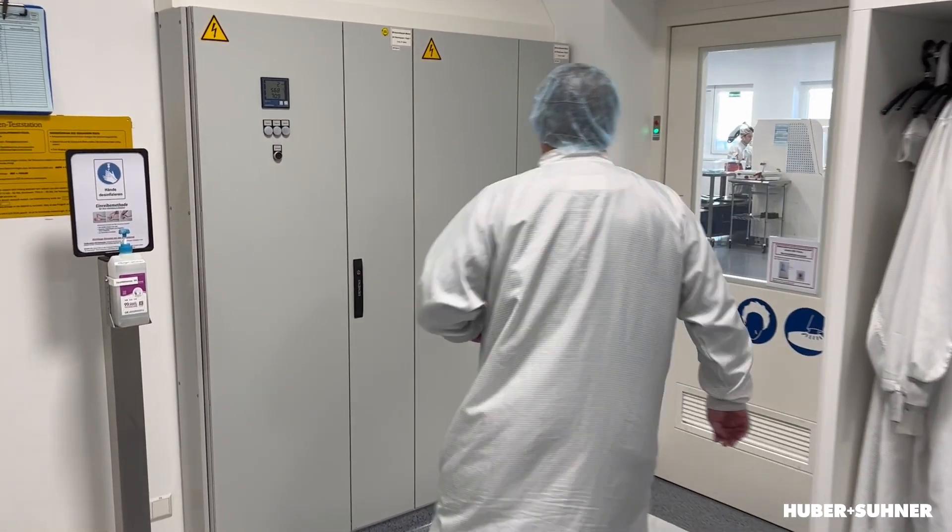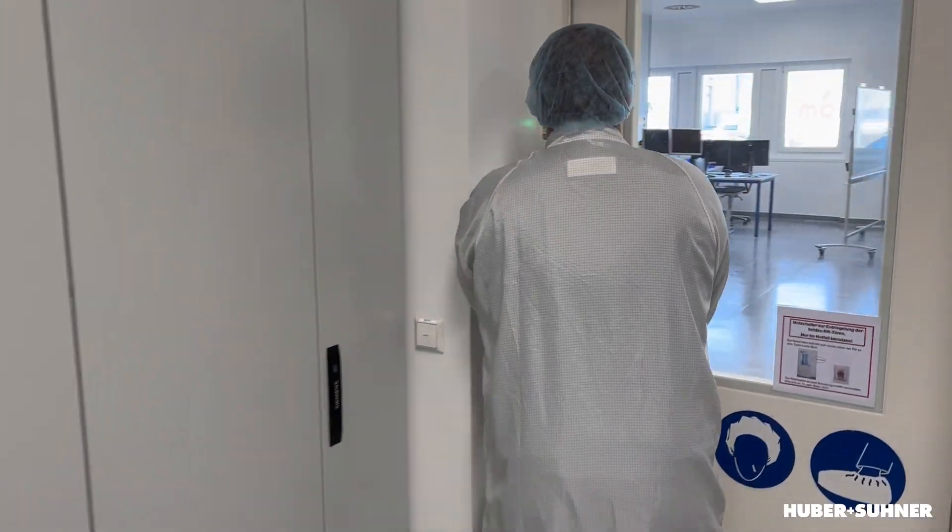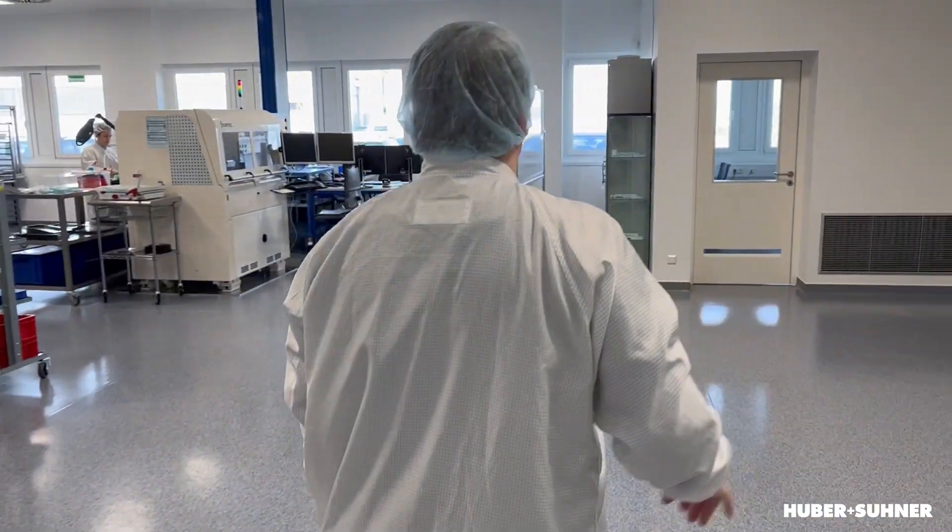Let's enter. That's the way how I enter the clean room. But for the material, there should be an easier way — and indeed, for the material we have a different air lock.